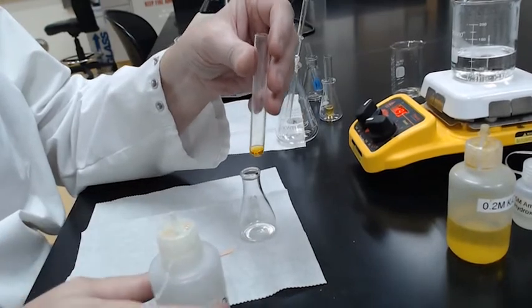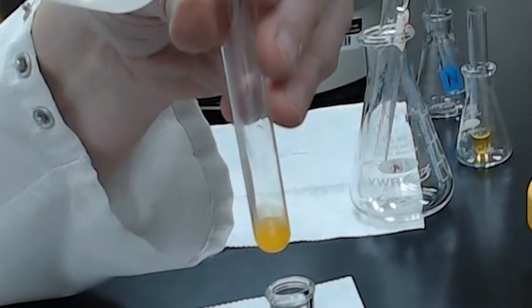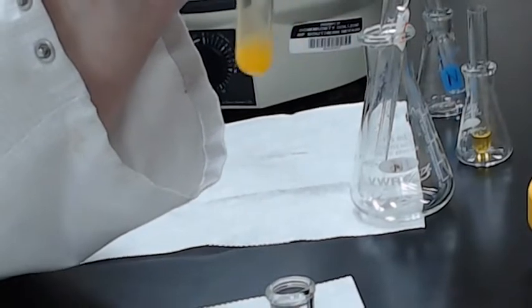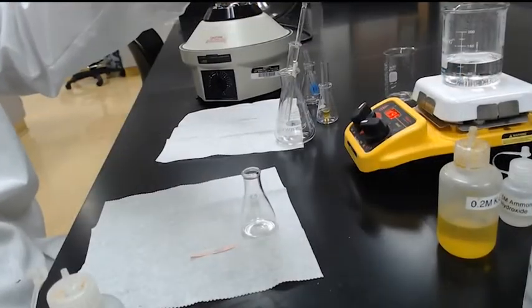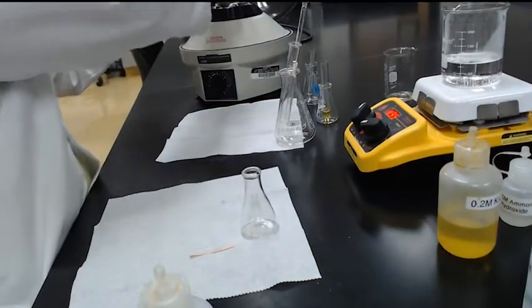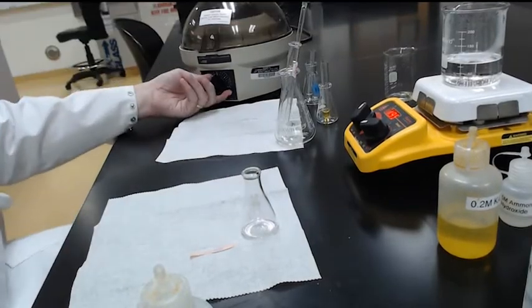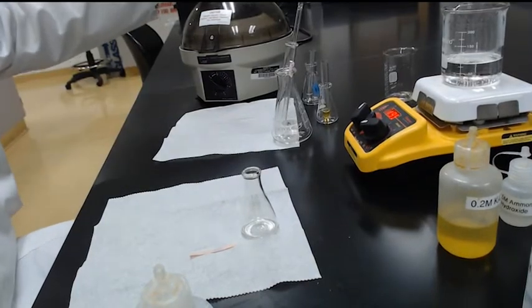Now we need to add this sulfuric acid, and what'll happen is it'll go white cloudy again, and that's because the solubility of barium sulfate is a lot lower than barium chromate. Okay, let's see if we can now centrifuge. Centrifuging tube. Okay, we're now going to centrifuge this one, and the idea being we are going to completely remove the chromate. So if we do enough washes and centrifuging.